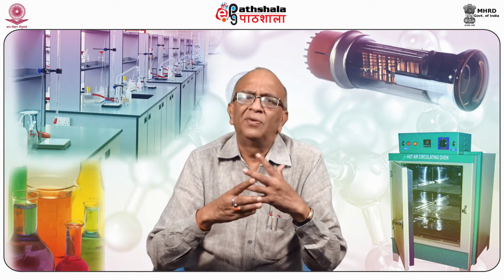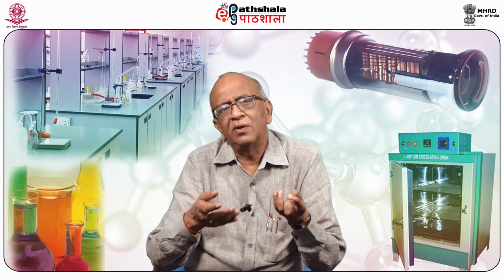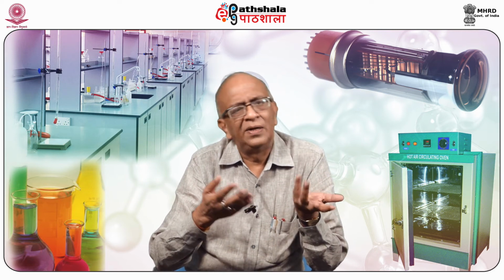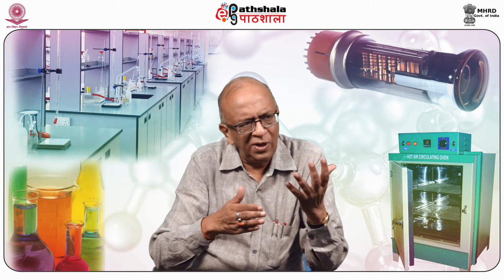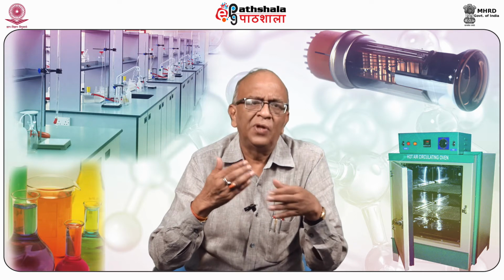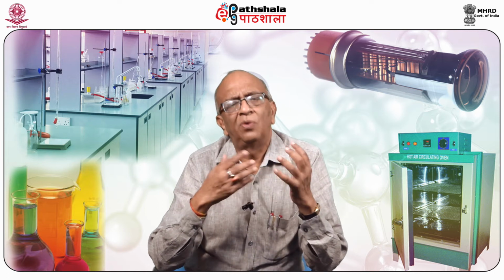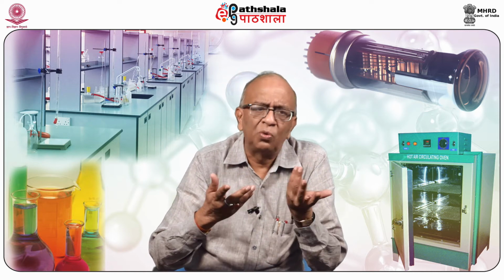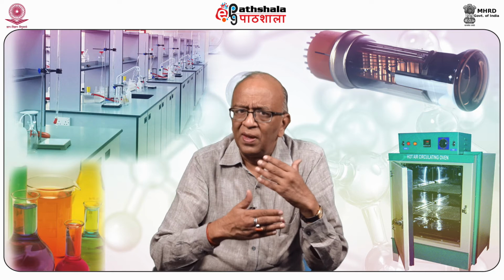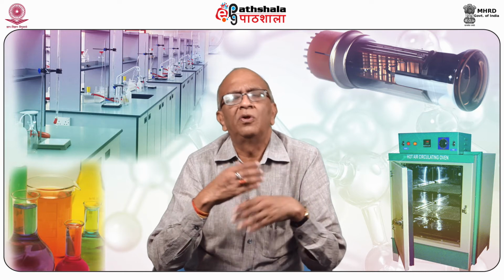As in other chromatographic techniques, in paper chromatography and thin layer chromatography also there are two phases. One phase, as you know, is always the stationary phase. Stationary phase may be solid or liquid. In case of paper and thin layer chromatography, in both cases, the stationary phase is a liquid held on a solid surface, and the mobile phase is a liquid. By different permutation combinations, we obtain a system where maximum resolution can take place and the mixture can be separated into different components.